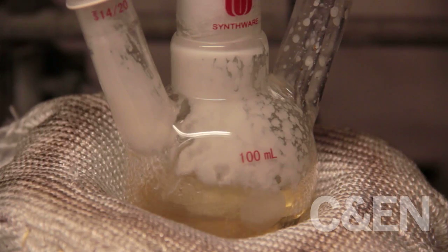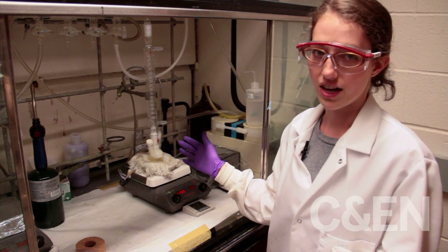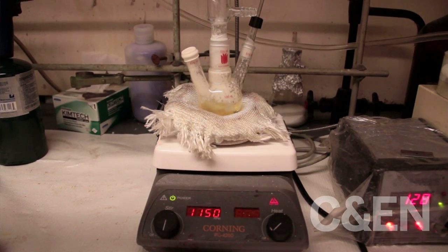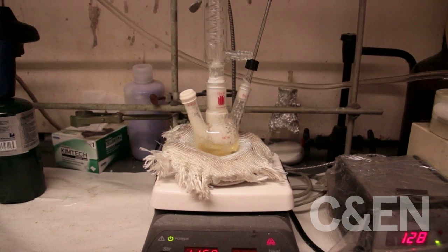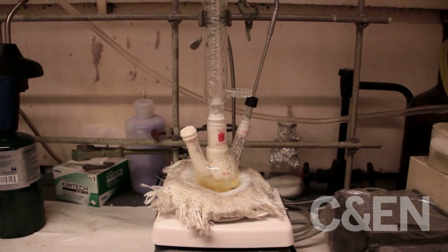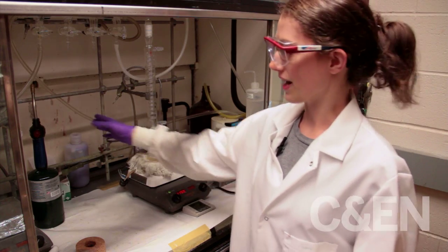Here we have some stearic acid and cadmium oxide that we heat up to dissolve the cadmium oxide in the stearic acid. Then we cooled it back down and added some trioctylphosphine oxide and some hexadecylamine, then heated that up again until it all melted. We've been putting it under a vacuum to get rid of all the water inside. There's some accumulation of the cadmium oxide and stearic acid on the wall, so I just need to heat that up to melt it off so it falls back down.